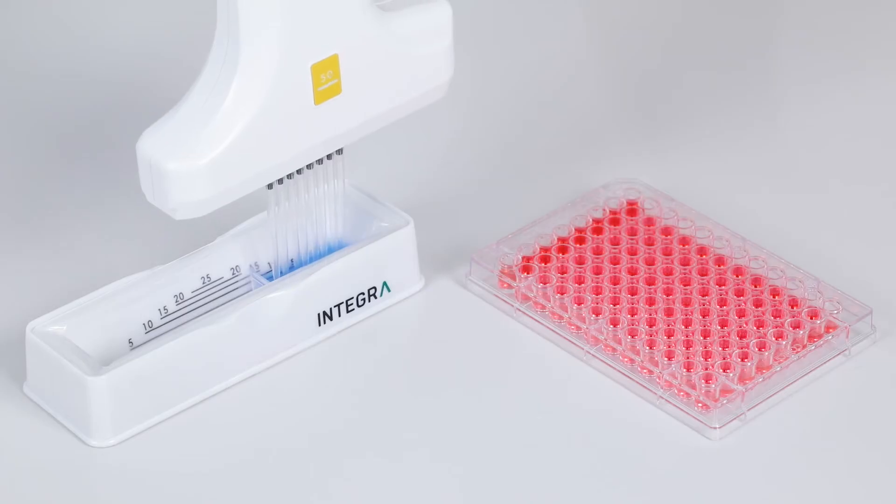Pipetting out of the 5 ml trough using a Voyager adjustable tip spacing pipette further reduces dead volume.